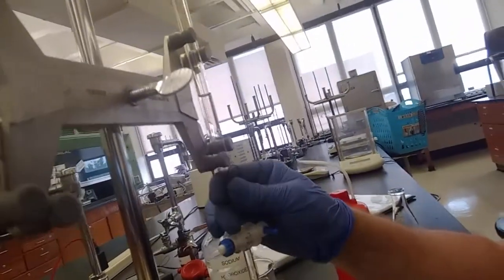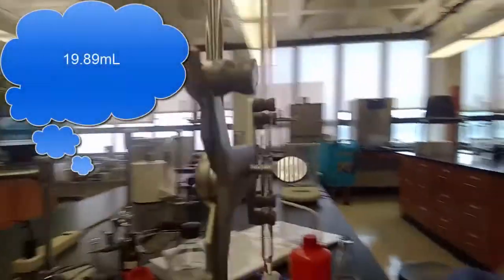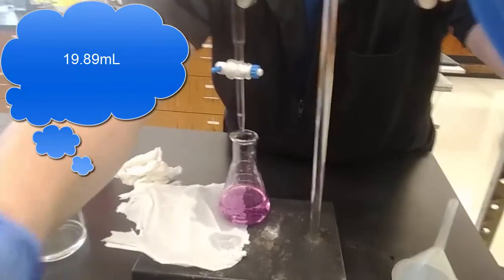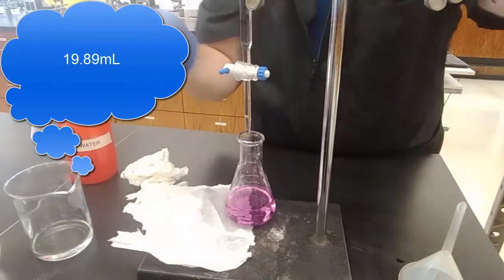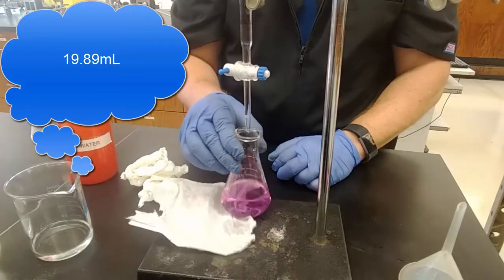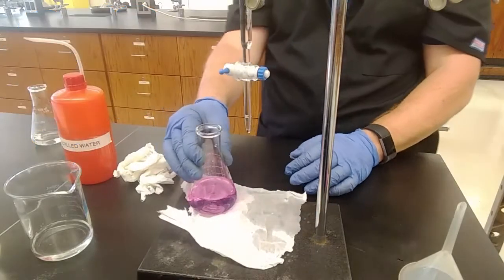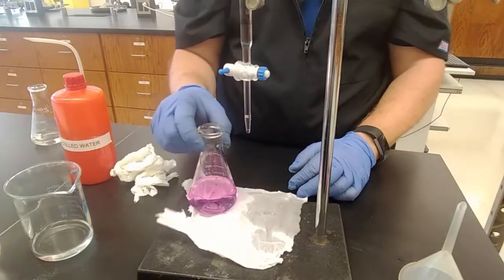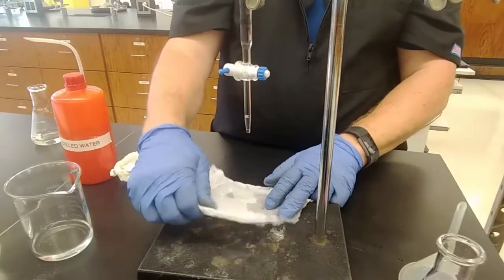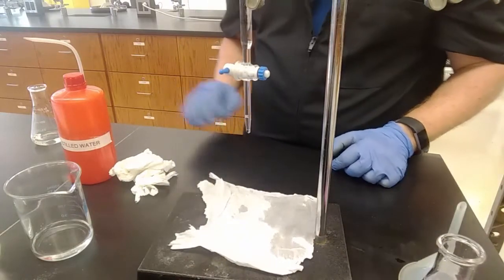And so I'm going to call it 19.89. Good year. College, 1989. All right. So that's 2 of 3. So we went from whatever the value was I said before to 19.89. As expected, it took about 17 milliliters.